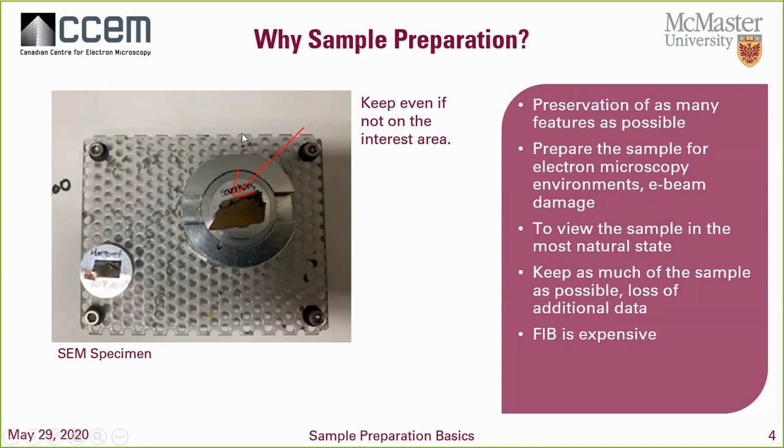So that's what I mean, that sometimes we need to make sure that we keep that area of interest because we never know what the customer is going to ask, right? We want to prepare the sample for those electron microscopy environments, right? We want to protect our sample, right? Sample coating is a good example of that, right? By just adding a coating, we can add a protective layer to the sample, aside from providing the conductive properties that we really need in terms of dealing with an e-beam.